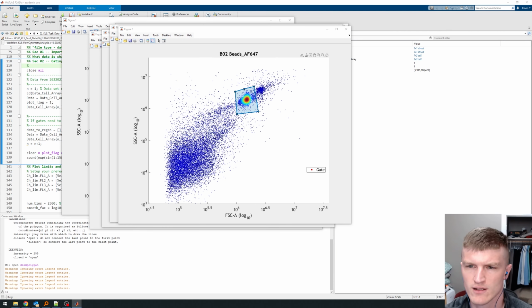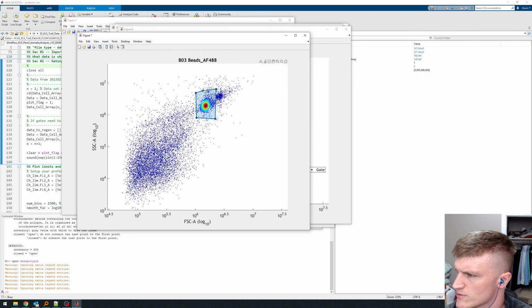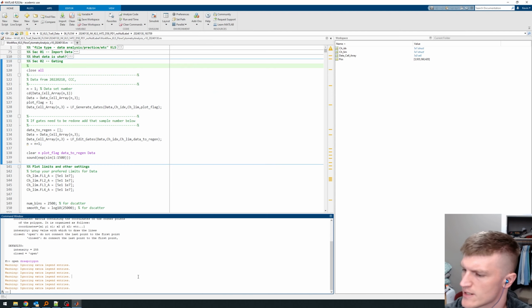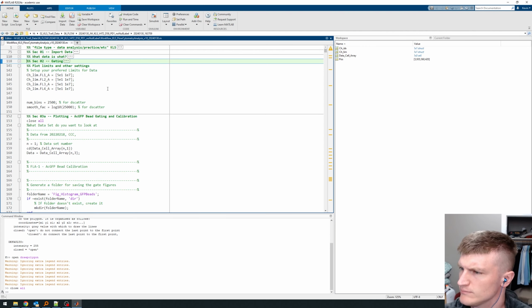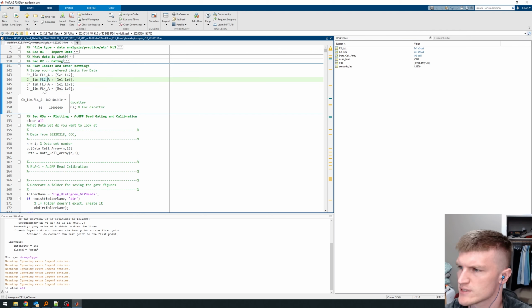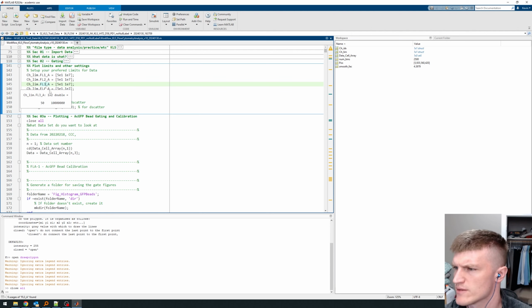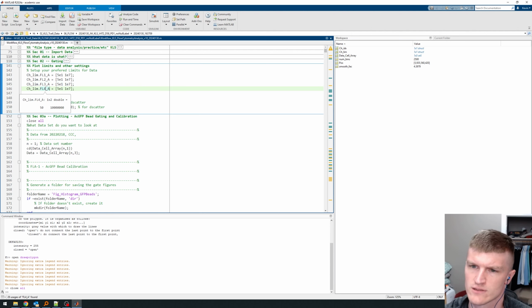You'll want to, if you haven't already done this somewhere, run your cells with a live dead indicator, so you have a fluorescent readout for cells that are alive. I've already done this for all of these samples. Okay, here's some basic plotting limits. Fluorescent channel 1, 2, 3, and 4. 1 is your GFP, 2 is 488 and a 560 filter, 3 is going to be a 488 and I believe 600 filter, and then finally you're going to be a 640, 640.